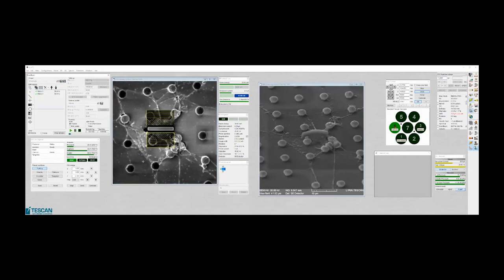It's life science, it's carbon, so I'm afraid to destroy it. So I use rather smaller current, and I will run it several times if possible. If it will not be sufficient to mill the material out of it, then I will use a bigger aperture with more current.